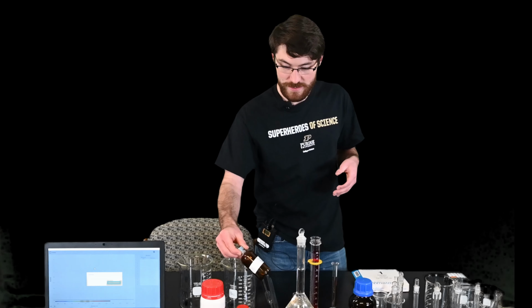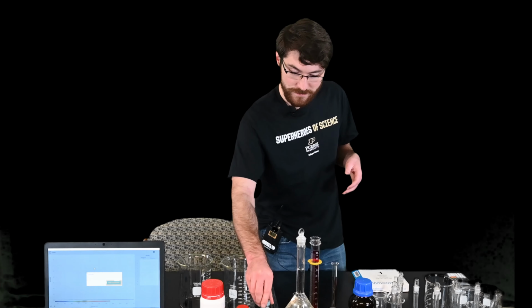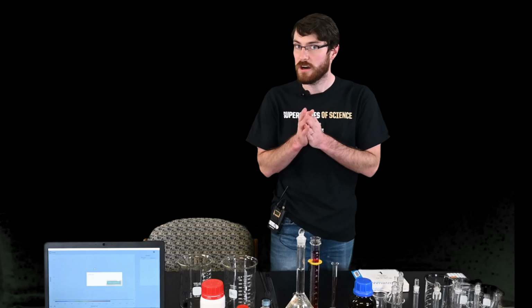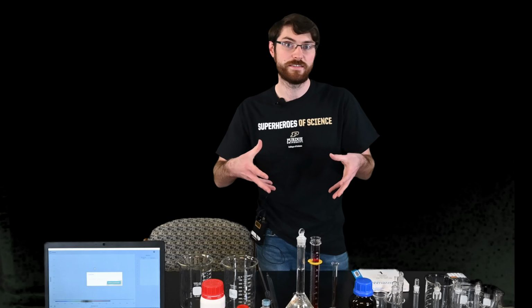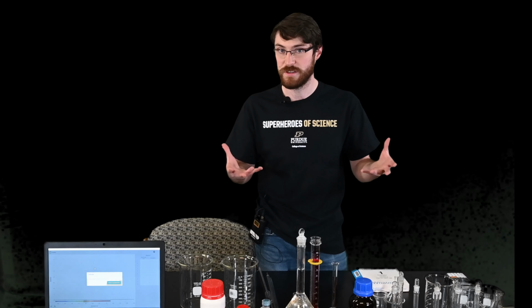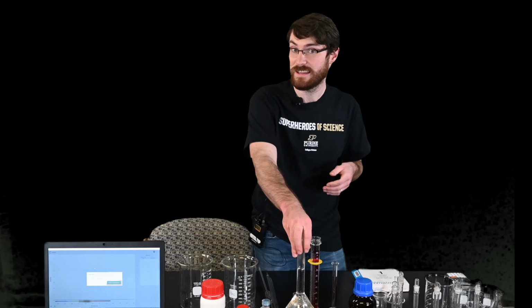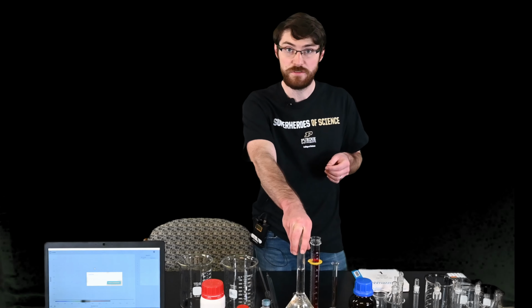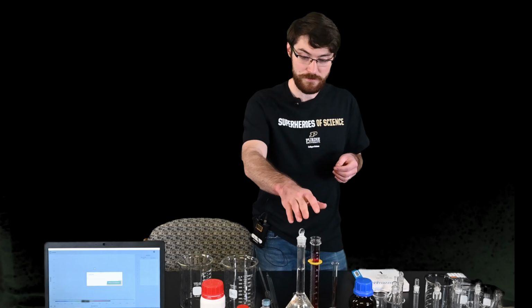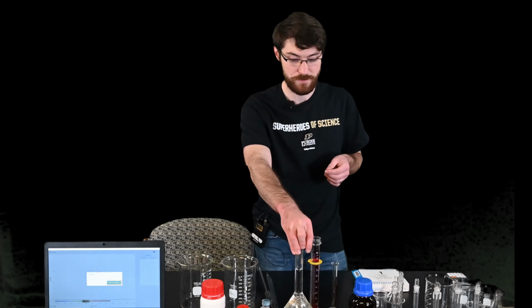We will need 1,10-phenanthroline. I've already prepared a solution of that. That's 5 millimolar. That is going to be our complexing agent that will complex the iron ions in solution and result in a colored species which we can measure on the UV-vis. We will need then an iron standard solution. So this is made of ferrous ammonium sulfate, and I have created a 1 liter solution that is about 10 ppm, so 10 parts per million.